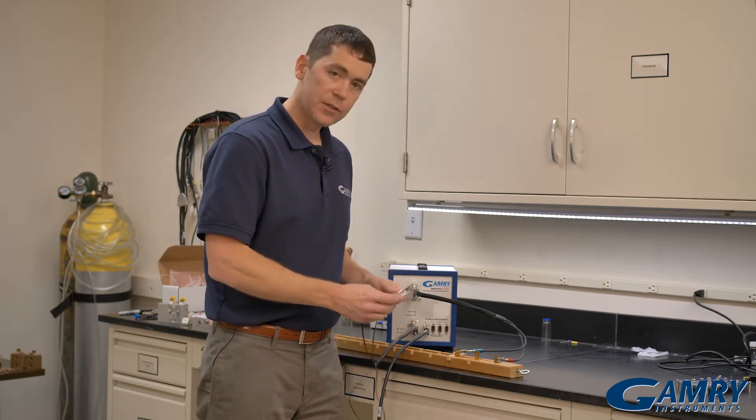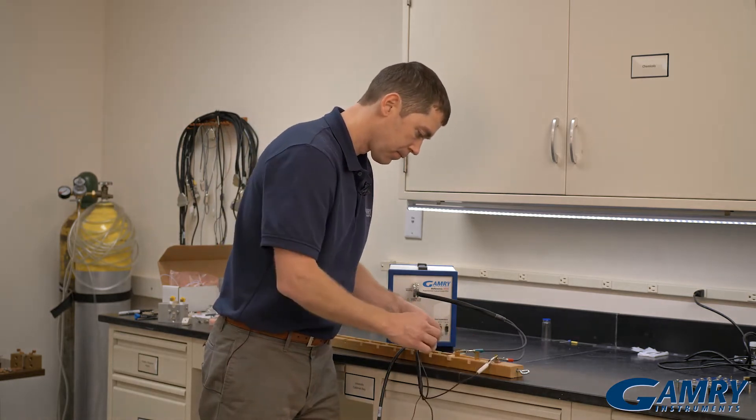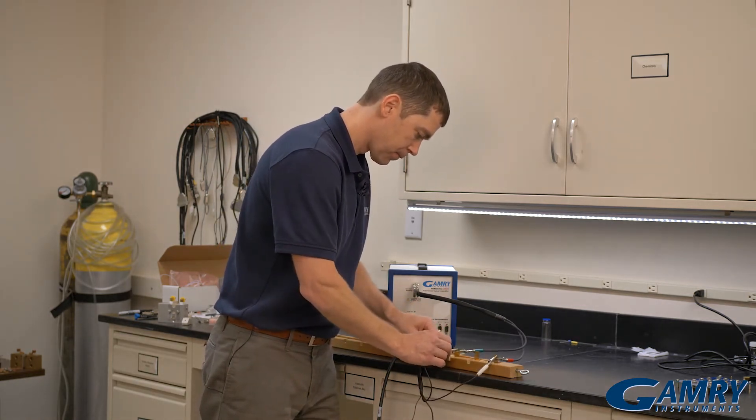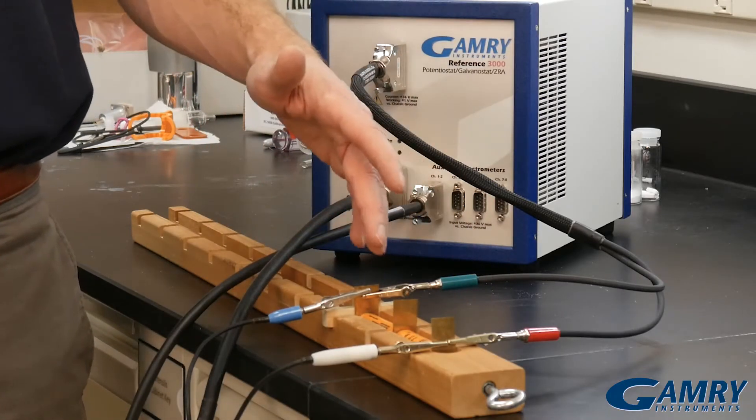Next I'm going to connect my sense leads. I'm going to connect my reference and my working sense to the ends of the stack as well. This allows us to connect to the whole stack.